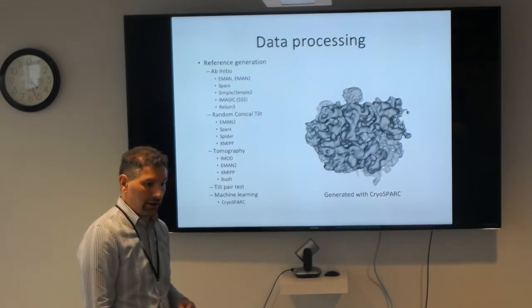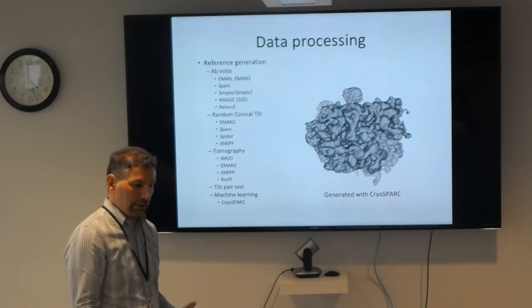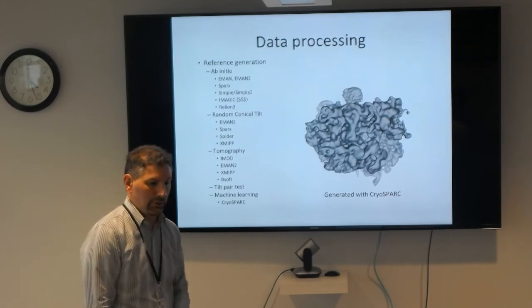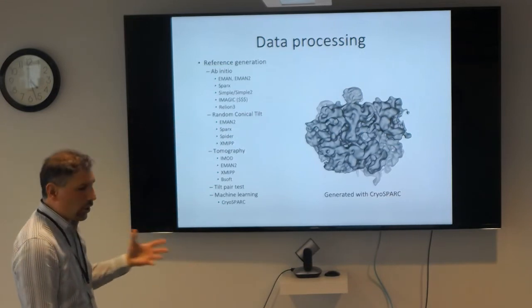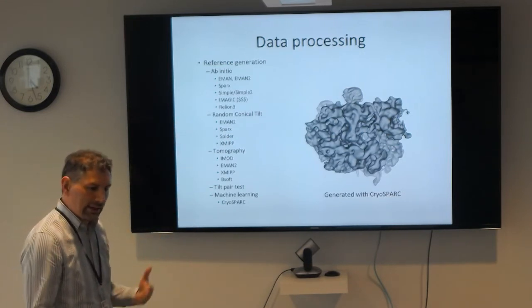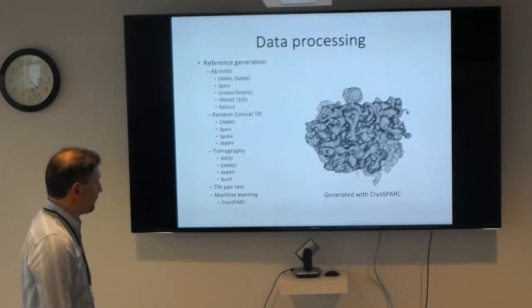One program that's not on here is EM Clarity. That's supposed to be the latest and greatest. We have that running, so let's see what EM Clarity is capable of. Again, by doing all of these programs, by knowing how this thing works, you can get creative and take many different routes at getting your final reconstruction at the end.